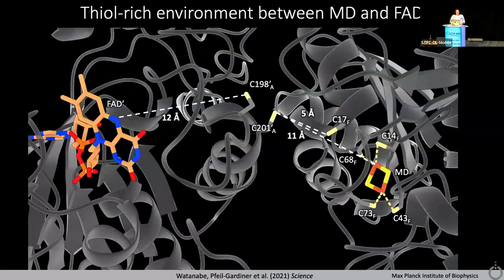But one of the conformational states that we solved gives us some new insight, in the sense that we see all of these very well conserved thiol residues lying between that 2 iron cluster and the bifurcating flavin. And it turns out that this flavin binding domain is homologous to thioredoxin reductases, which catalyze a reduction of a disulfide bond via a covalent intermediate with a flavin. And so that's our best hint at what might be going on, that these complexes might actually be catalyzing that reaction in reverse. But we still have a lot of work to do to see whether that is in fact the case.